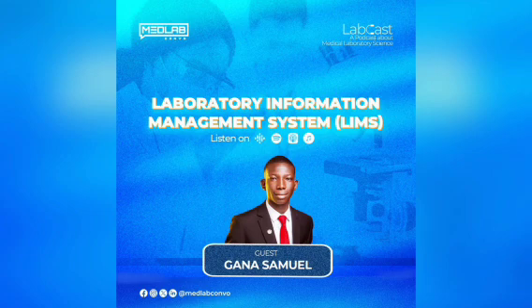If you've ever dealt with lost samples, delayed results, manual errors, or the stress that comes with high volume days, this episode is definitely for you. LIMS has become the most important digital tool, or one of the most important digital tools in the lab. And if you understand how it works, it can completely change your game.